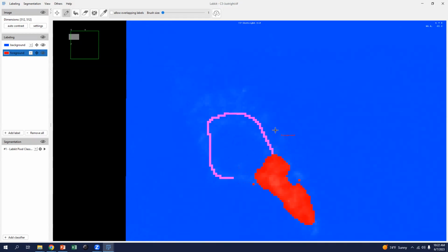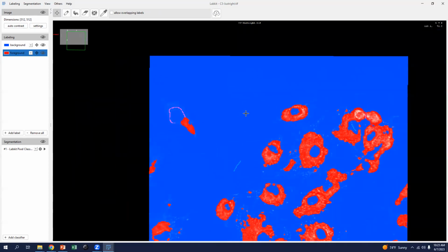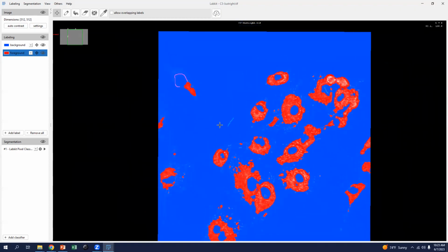Mouse wheel, or I think 2 fingers on the trackpad might do the same. The more labels you add at any given step of the process, the longer it's going to take to process, because it has to include that new information.